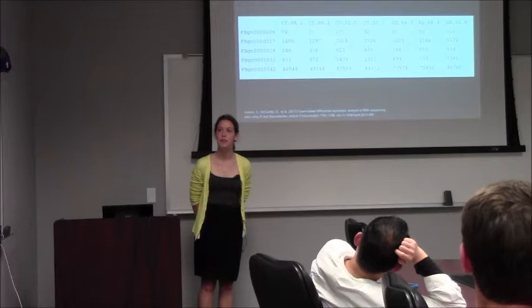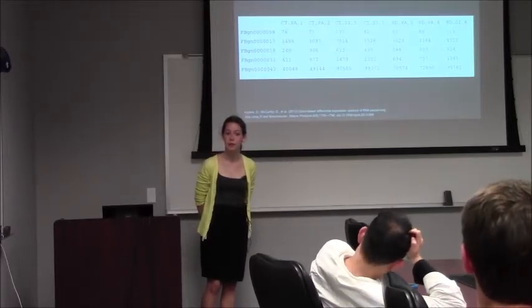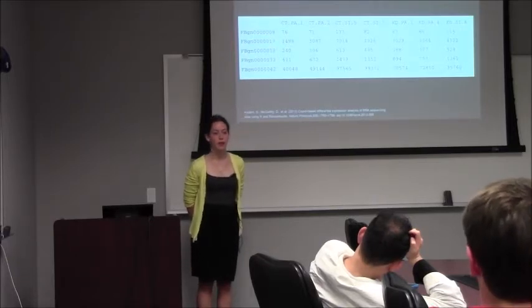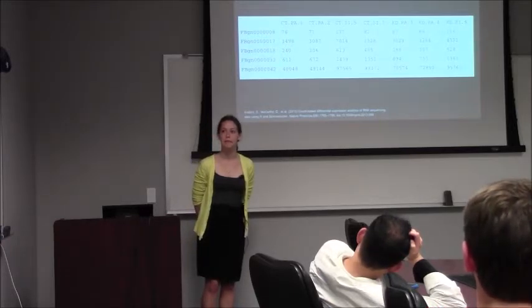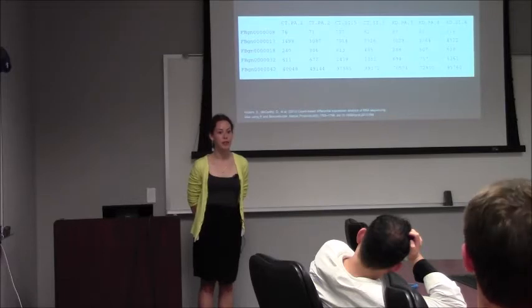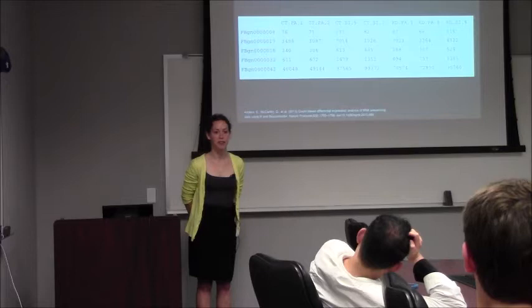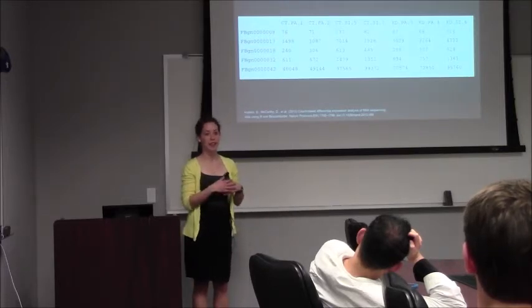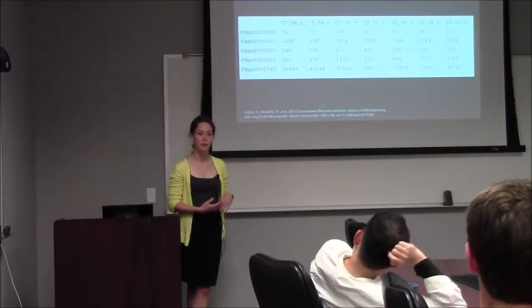I think we estimated, because we had 40 million reads per sample and 64 samples, we could get it done in half a day or something by using the cluster. But if you didn't have a cluster, or if you're already straining on the data set, or maybe if you had a lot more data than we did, then that could be an issue, because these data sets can be big.